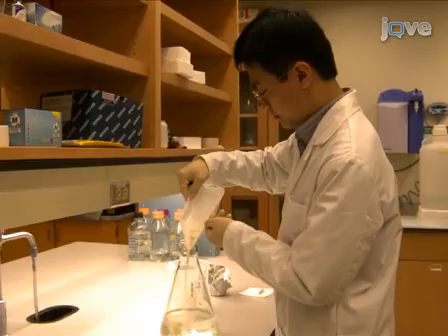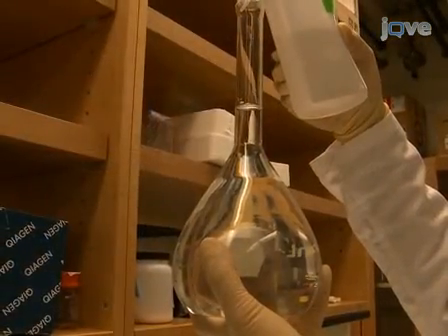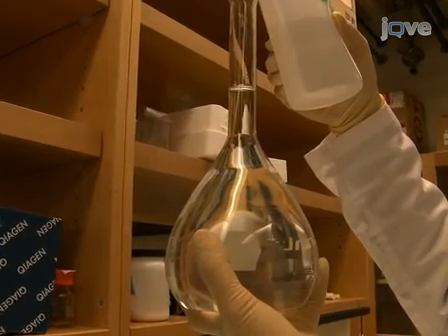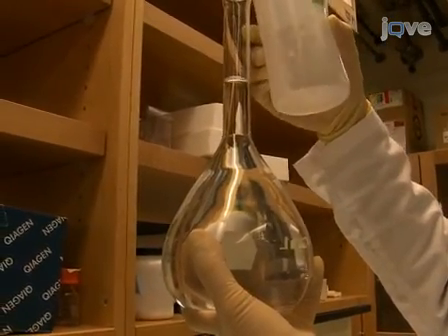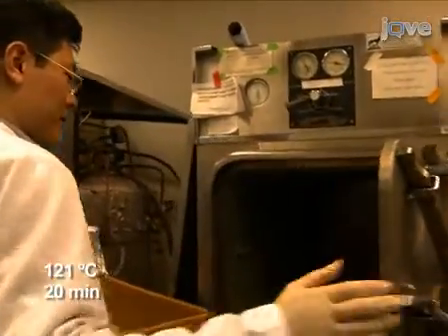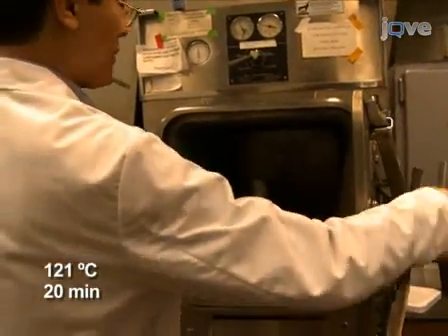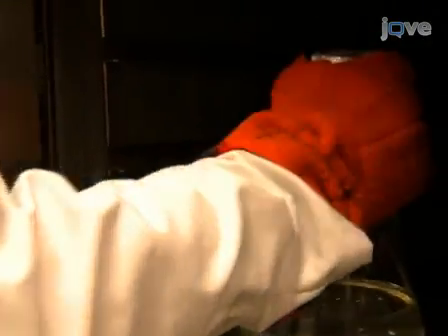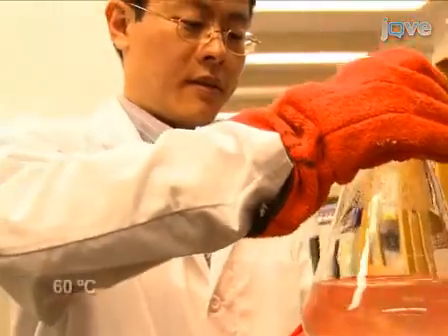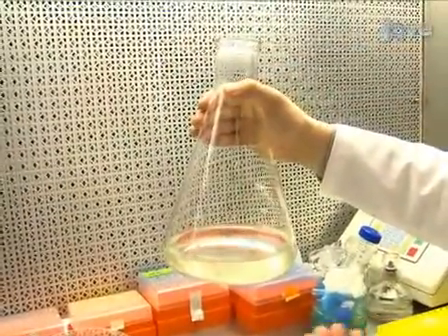Next, add 7 grams of agar, which does not dissolve but will solubilize later during autoclaving. Finally, adjust the volume to 1000 milliliters. Sterilize the MS medium by autoclaving at 121 degrees Celsius for 20 minutes, keeping the stir bar in the bottle. After autoclaving, stir the medium on a stirring plate to cool it down to approximately 60 degrees Celsius. Stirring while chilling prevents the agar from precipitating at the bottom of the bottle.